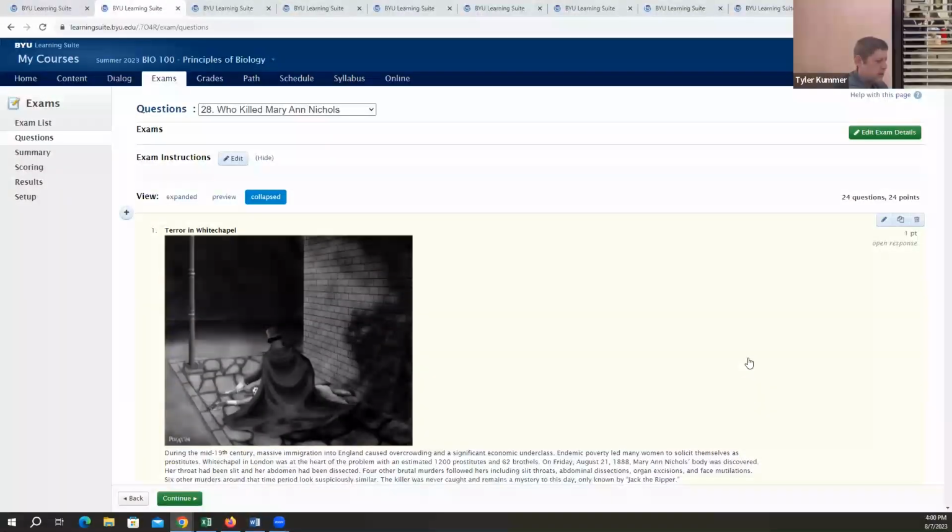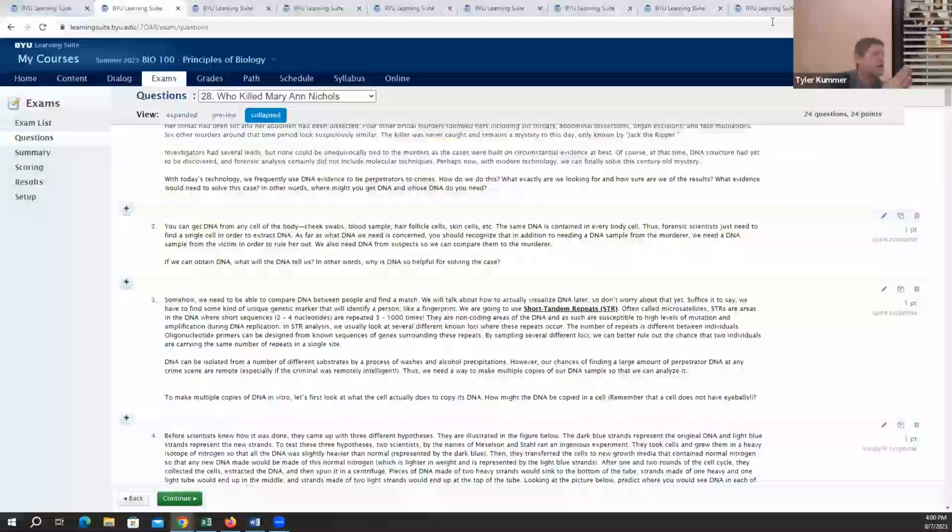This first one, though, is going to give us some ideas about specifically what we're doing with DNA and how we use that DNA in various ways. The first thing we want to understand is how do we go about essentially collecting DNA and making that DNA so we can analyze it. And the way we do that is by making copies of that DNA in a synthetic situation. And that's through the process of polymerase chain reaction, PCR.